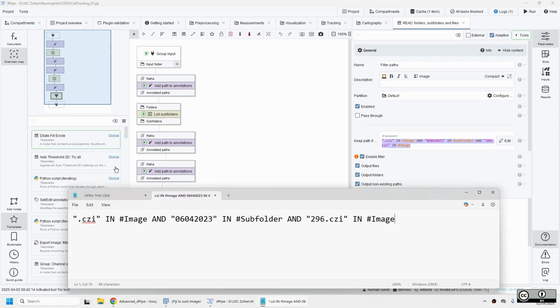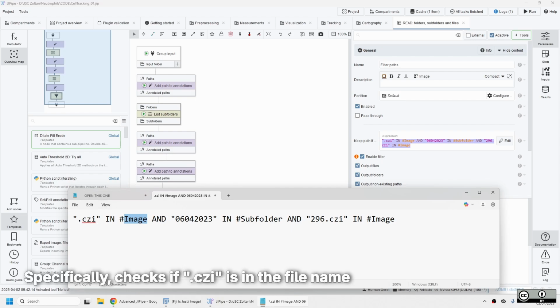So what I did was simply that. First of all, I said, maybe there are a bunch of images in the folder somewhere. You didn't clean them up, or whatever. So you need a filter, and you saw this yesterday, which checks the image type. So you say, okay, this is the extension of the image. This must be in the image annotation. And since the annotation was created above here, the program knows already what image is. And it will check, does it end with CZI?